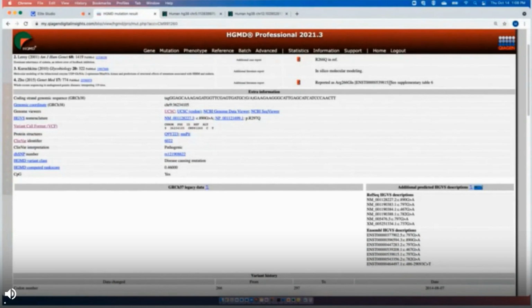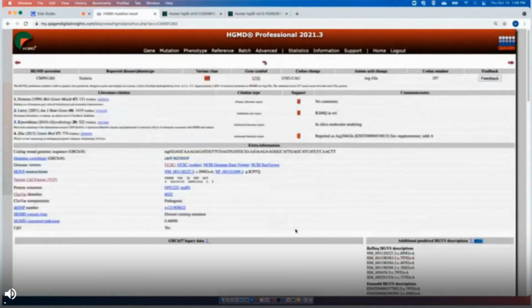And so you can match it up, that 815, and from here it gives the c.DNA, but you can confirm that the 797 G to A is actually this 266Q if you translate it to amino acid. And so here's another example where first reviewing the HGMD entry gives you key insights that will help you as you continue with your literature review.